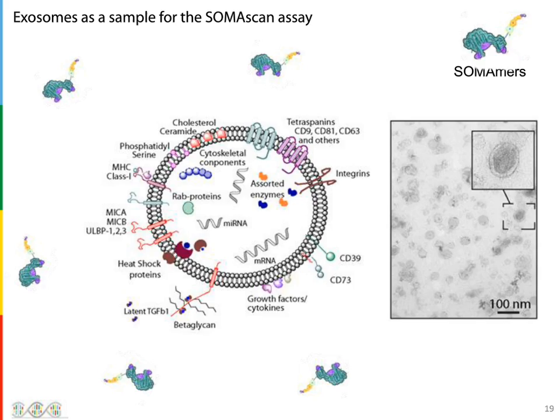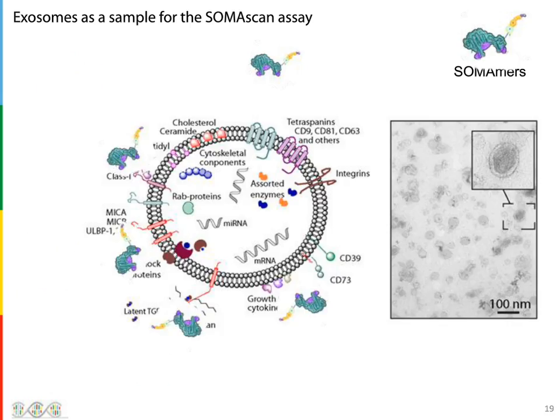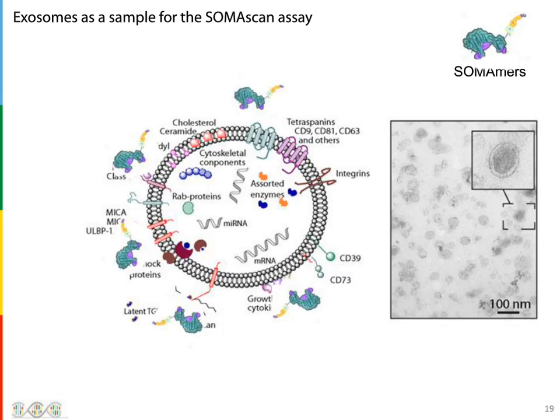Applying our exosome vesicles to the SomaLogic platform was something of real interest to us. If you imagine adding a cocktail of somamers, which Steve spoke about, to these vesicular structures, it's quite likely that some of them might bind to proteins which are available to interact with, such as those on the surface. However, there might be others which are simply not able to penetrate that membrane structure, and may not reach those proteins protected within the lumen of the vesicle. So we had to think of applying the sample to their technology in a perhaps non-standard way, and think of options for liberating those inaccessible proteins so the somamers could bind them.